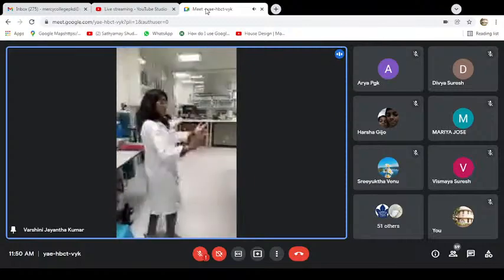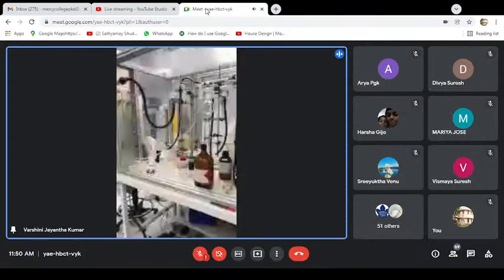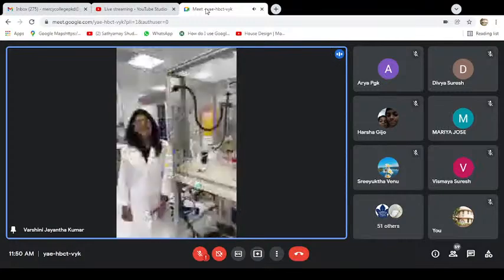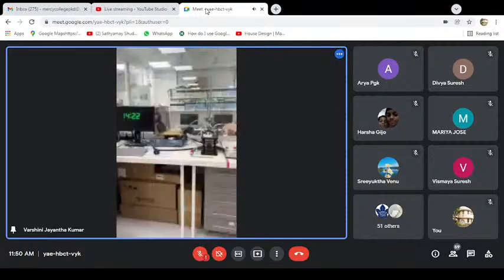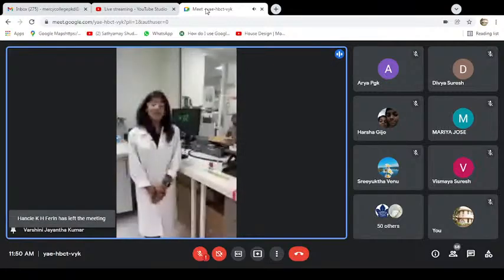And now we have, again, more fume hoods here. And this is Elena's one, but barely used because she's a physical chemist. So we all make this as a common fume hood. And here we have a setup for electrochemistry, which is, so right now I'm doing cyclic voltammetry.